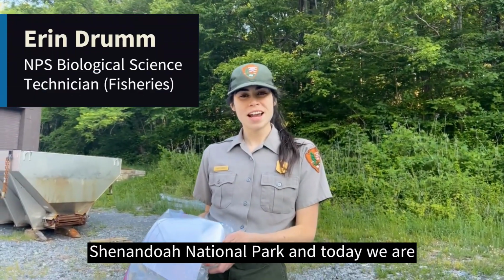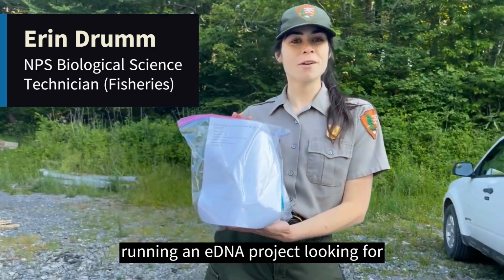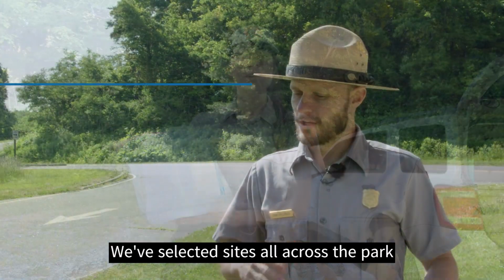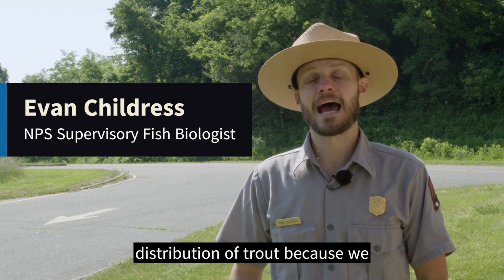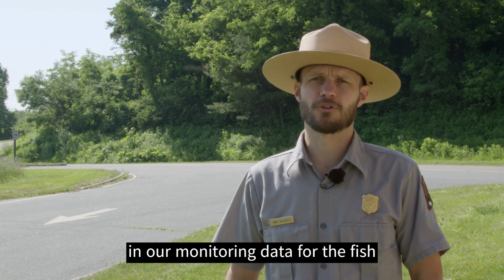I'm here with Shenandoah National Park, and today we are running an eDNA project looking for absence and presence of brook trout in different streams at our park. We've selected sites all across the park to try to understand the current distribution of trout because we have identified some concerning trends in our monitoring data for the fish.